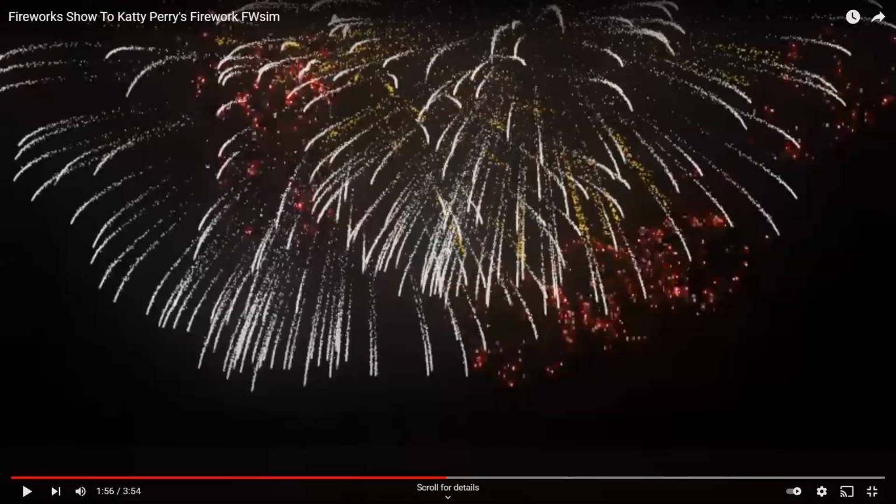You guys have that. When you're looking at a fireworks show, like on the screen, you are seeing different colors of fireworks, not because of food coloring, not because of CGI, but because there are different elements that are burning in combustion reactions. Different elements burn different colors.